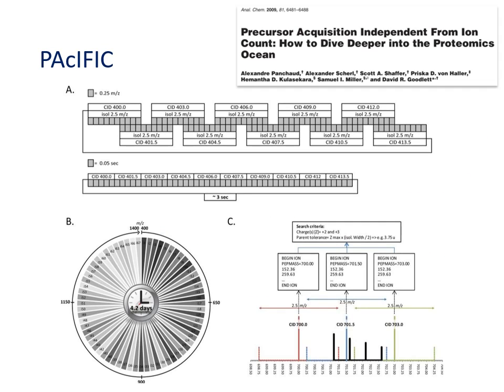Of course, if you have a sample as complicated as blood plasma or a tissue homogenate, is a 15 mass to charge range really that useful? And of course it's not, but this 15 m/z range is the maximum you can cover using relatively narrow overlapping windows on an LC timescale.